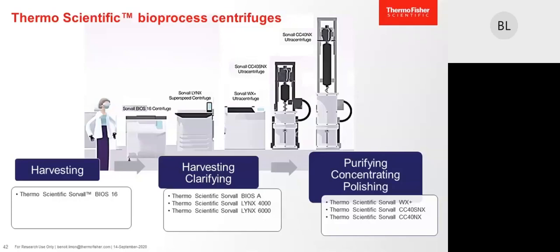I see the next question from Leo. In the separation and the purification process, the difference between centrifuge, chromatography, ultracentrifuge, ultrafiltration technology, could they replace each other? Okay, so thank you for the question. In the purification, there are 3 techniques.